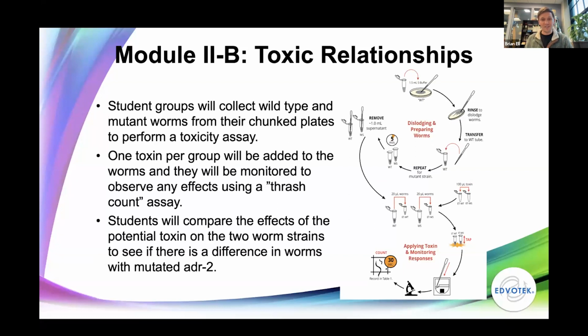Obviously, the worms are growing, so it is not a lethal mutation. And you'll notice that if you look at them, they don't seem to really reproduce any slower. They don't really move any slower. But if you were to do different sorts of chemotaxic assays with these, you'll notice that they respond differently to chemotactic signals than our other worms. So especially with volatile compounds, they seem to not necessarily be as attracted to them. And this is likely related to signaling within some of these neurons that gets thrown off in the worms when they don't have this ability to splice RNA in the same way that we would expect.